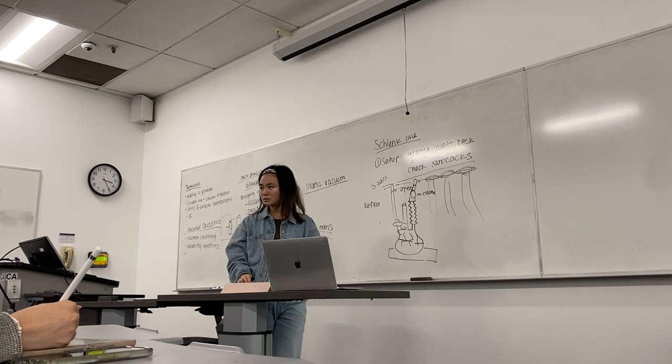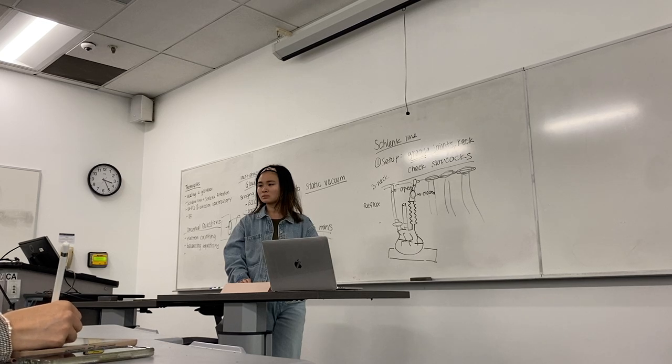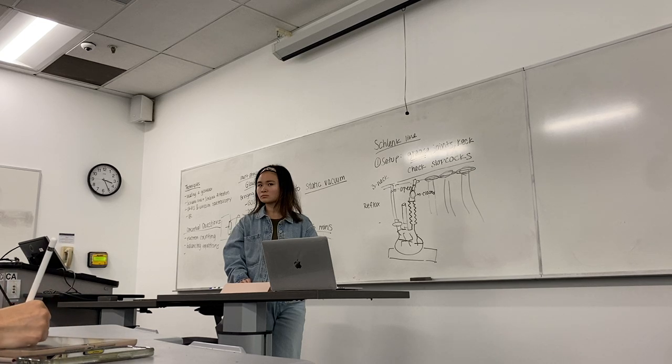We did notice everyone was having trouble when they took apart the stopcock. It came without the metal thingy attached, so we had to grease the stopcock. Wait, is this the Schlenk line? No, a Schlenk flask with the inlet attached to the flask, right? But the stopcock is out. It's not attached, so we have to grease it, put it in, and then clip it with the metal.